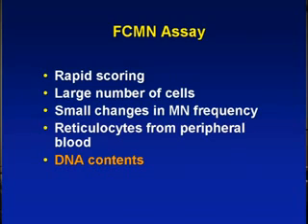So much for the microscopic measurement. Let's talk a little more about using the flow cytometer to measure the micronuclei. There's some advantage of using flow cytometry. You can do much faster scoring. You can do these things within a few hours after sampling, if you could, versus you still have to wait about 3 days. You can measure several million, 10 million, whatever number of cells you like to get.